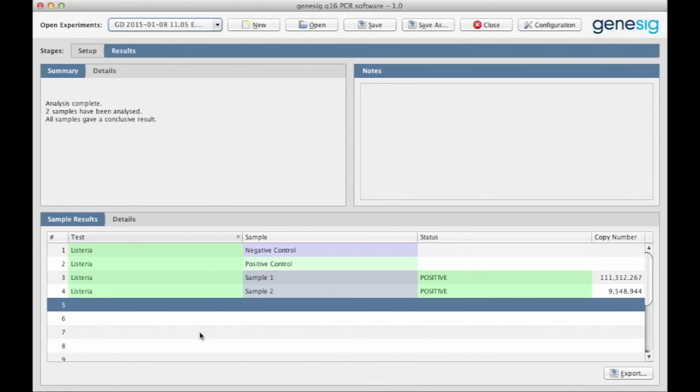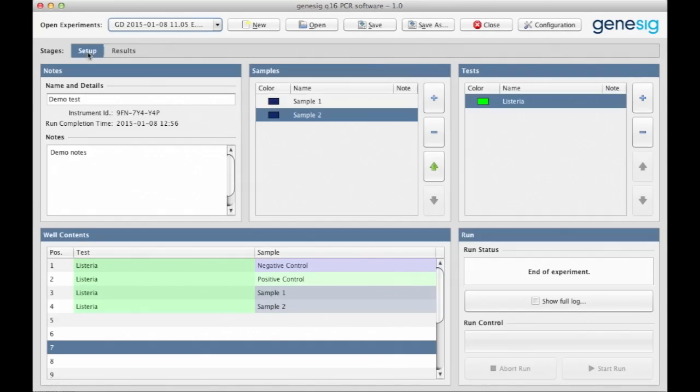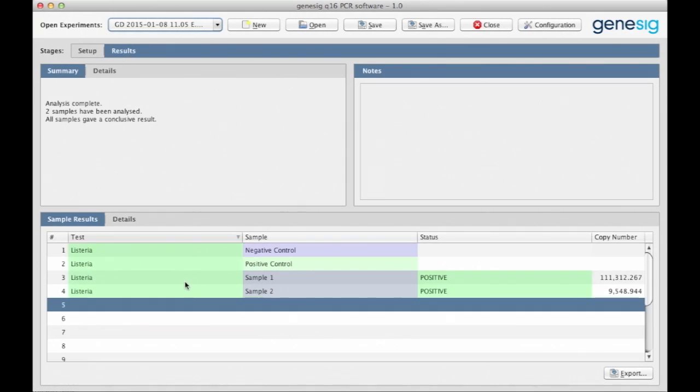But the really interesting bit is down here. Here are the results. The results are presented in exactly the same order that you arranged them during test setup. You can ignore the top two rows as these are your positive and negative controls. The results for the samples are displayed underneath.